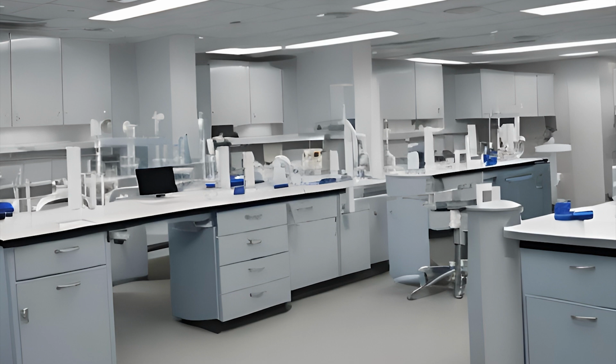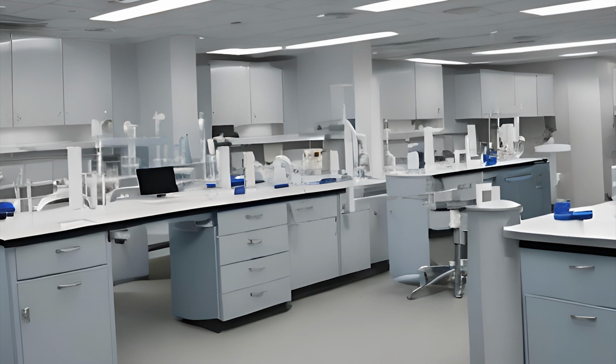A common contaminant doing microscopic analysis for crystals is the powder from someone's gloves who's either working at the microscope or was processing and preparing the specimen or collecting the sample. The starch powder from someone's gloves can actually look like a Maltese cross crystal underneath a polarized microscope. Now it's distinct in shape, so you see it, you know what it is, but it's a contaminant that's getting in the way of what you're actually looking for.